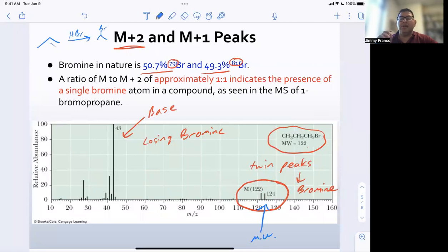So if you did a reaction like this, where we add HBr to it, one thing we could do is put this on a mass spectrometer, and hopefully what we should see is that really nice bromine peak, right? And the bromine peak should add across it, and we get the bromine to our molecule. And so it should work really, really nicely in terms of showing this nice bromine peak here at the bottom.